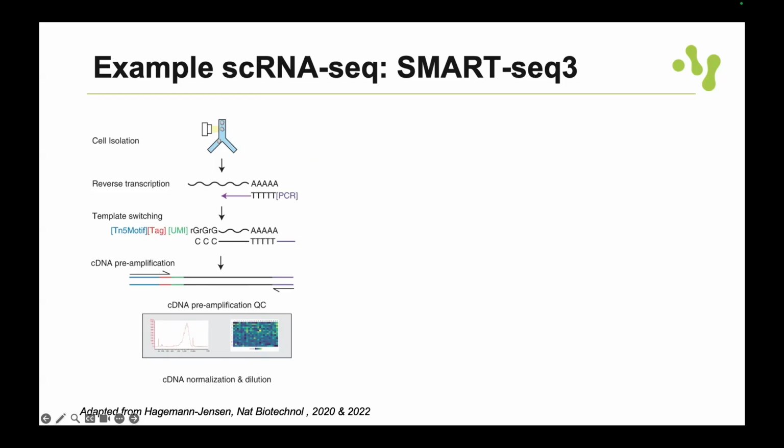So it adds the tag at the 5' end. They want to be really sure that the 5' end gets that cut and gets tagged, since that molecule stops there. If it's internal, you have sequence that is 5' upstream of that. But here it's at the end of the molecule, and they wanted to be sure that the tag gets added there.